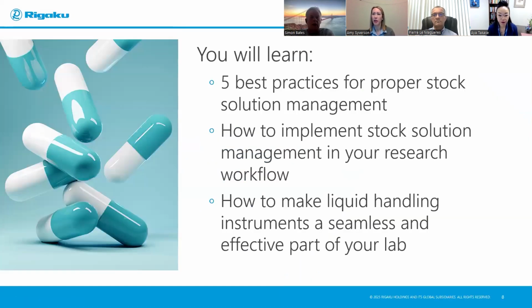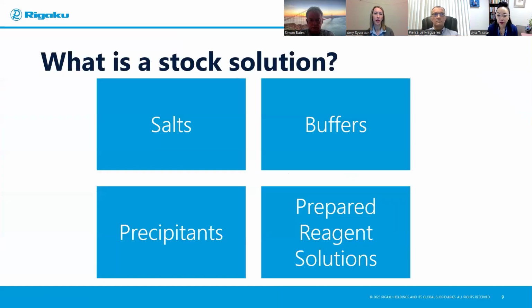During this session, we're going to talk about the best practices for managing your stock solution inventory and how to make best use of your time and keep projects running smoothly. During this webinar, you're going to hear me refer to the term stock solutions often. These categories are essential for many laboratory settings. This is just a high-level classification system that we use in our lab.